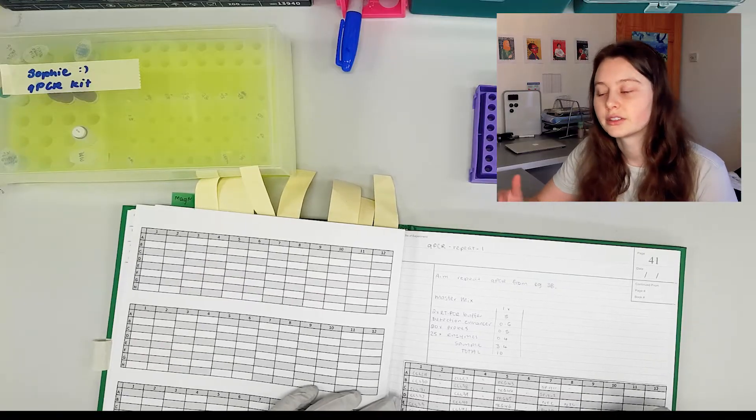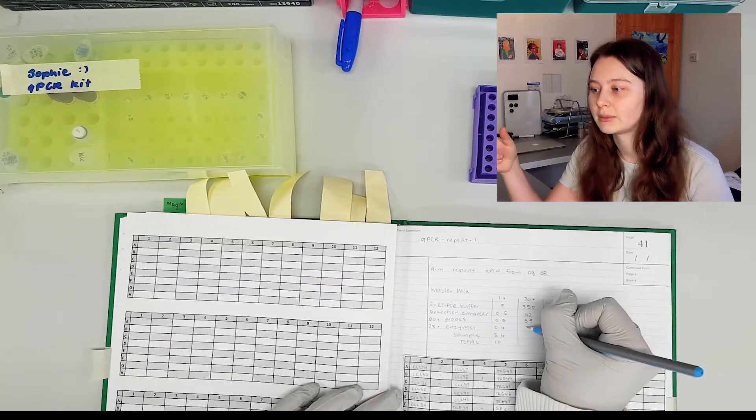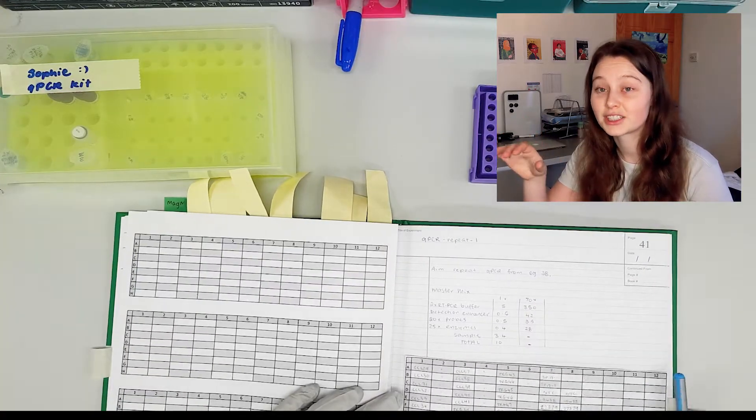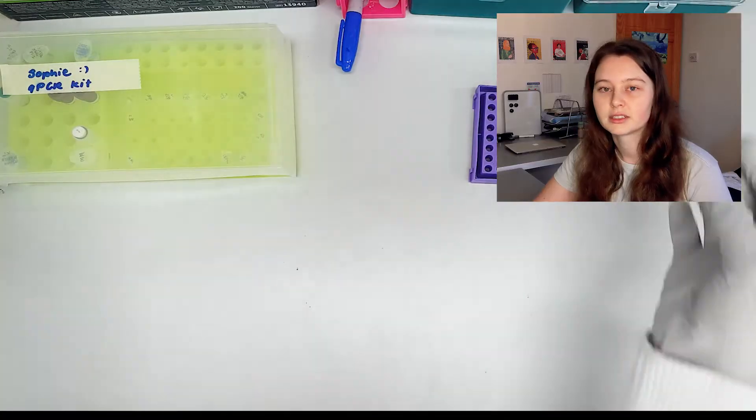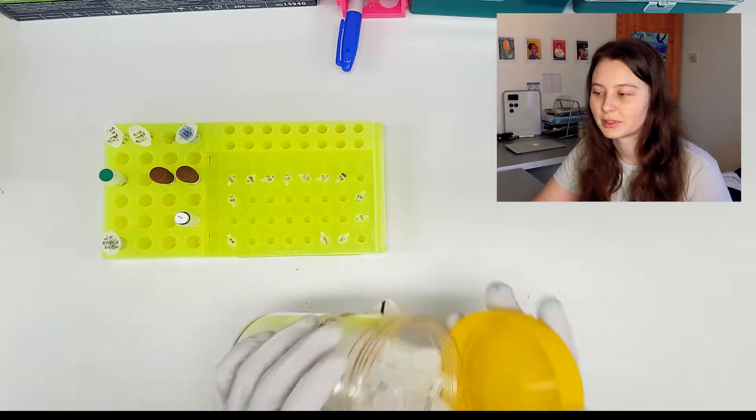So first I wrote out those concentrations at a one time, so how much I would need for one reaction, and then I wrote it out at 70 times. I give myself about 10% extra, there is nothing worse than getting halfway through a plate and then discovering that you don't have enough to finish the plate.